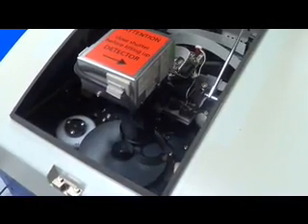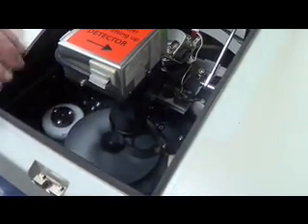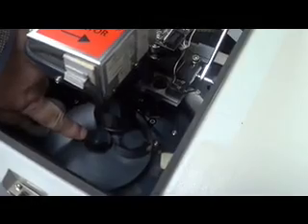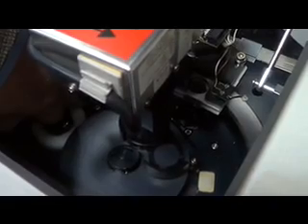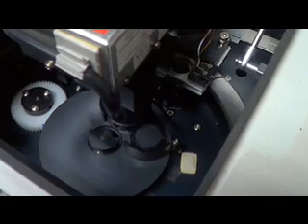The next step after you close the shutter is to look down inside the instrument at this half circle. What you want to do is rotate the white wheel until the half cutout circle is parallel to the PMT.